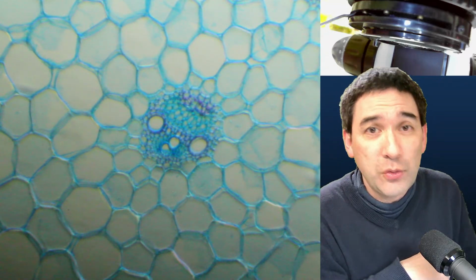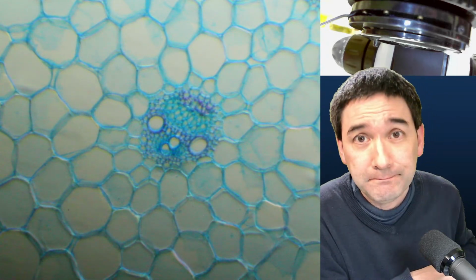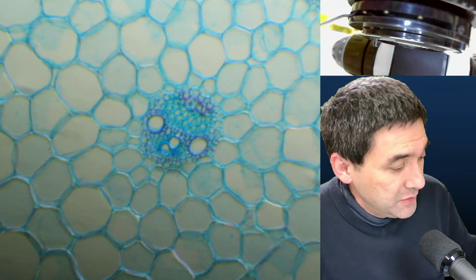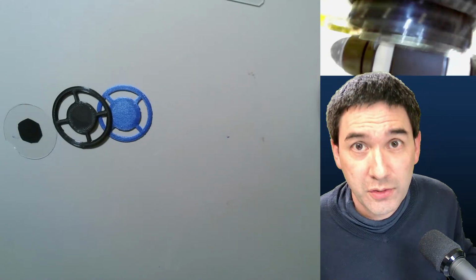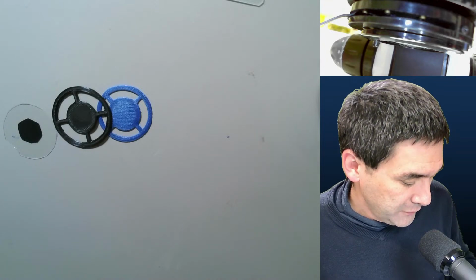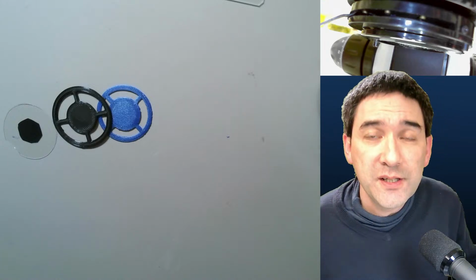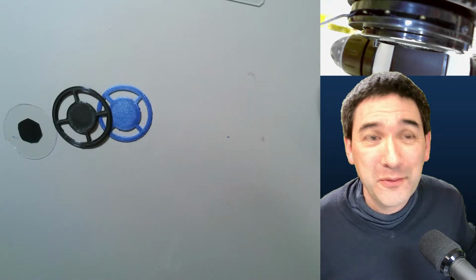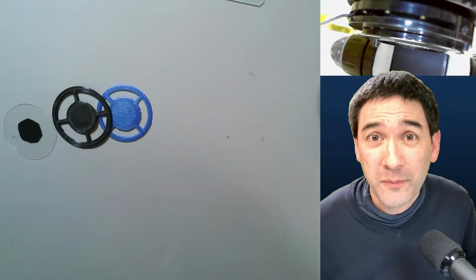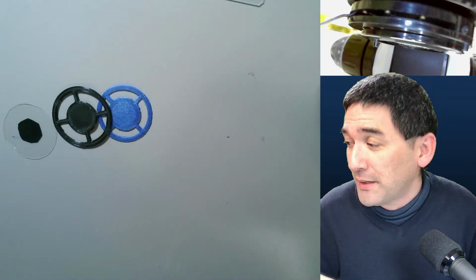I was then trying to figure out how the pollen looks in darkfield. The idea was to see if some mounting media result in a better dark field impression than others. I have to tell you that there was not a huge difference, but there was one difference, in that some mounting media did change the appearance of the pollen, and that's also something that we can observe. I would like to do that not only with the microscope that I have here with the dark field, but also with my DIC microscope.